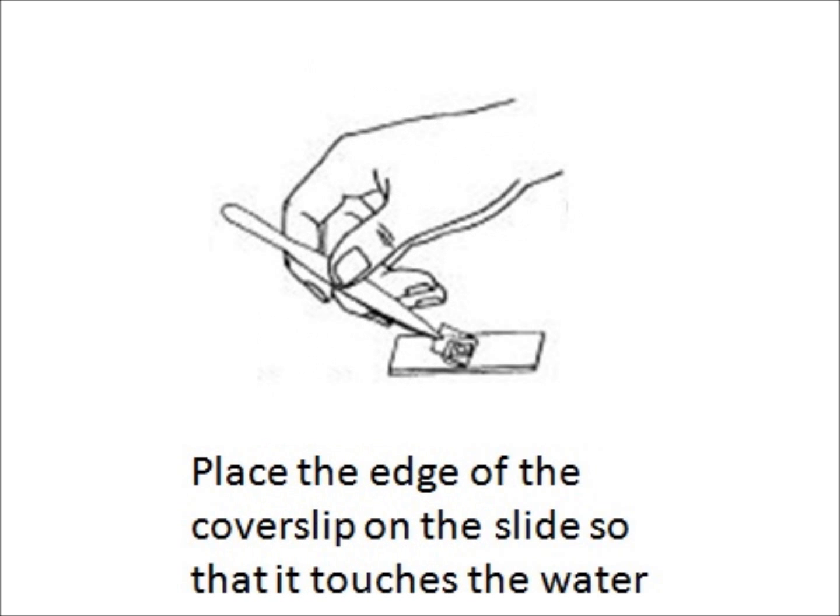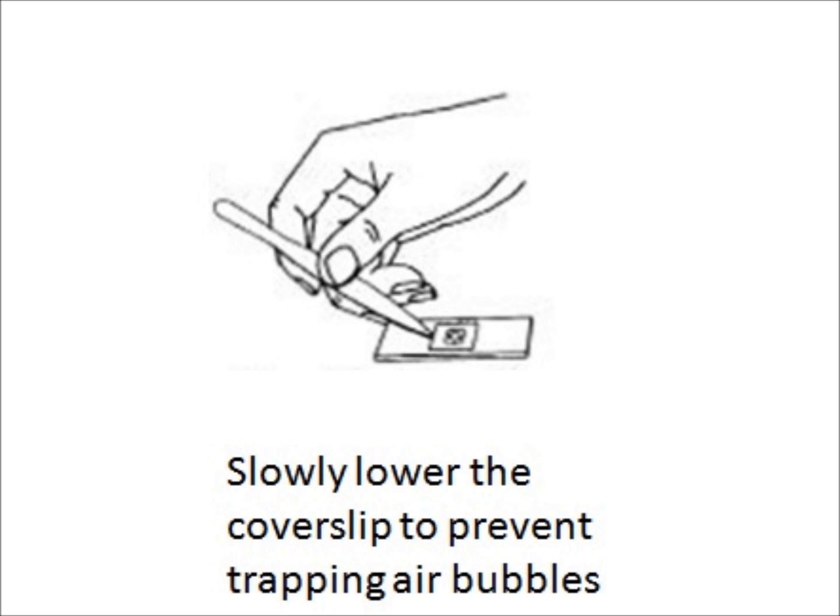Then you need to put a cover slip on without trapping too many air bubbles. The best way to do this is to hold the cover slip at an angle and actually to touch the edge of the water and then to lower it gently. You can do this using your fingers or some sort of implement.